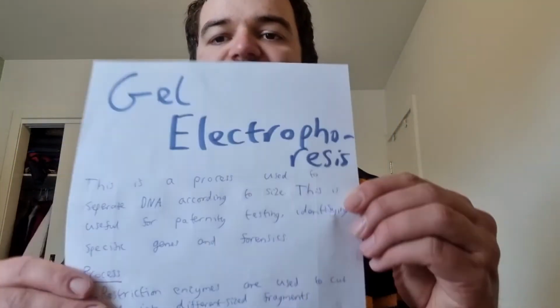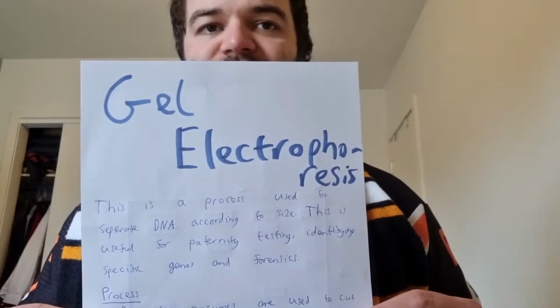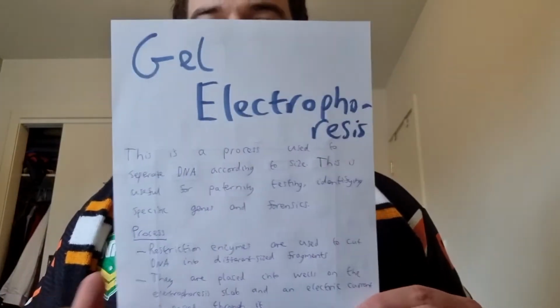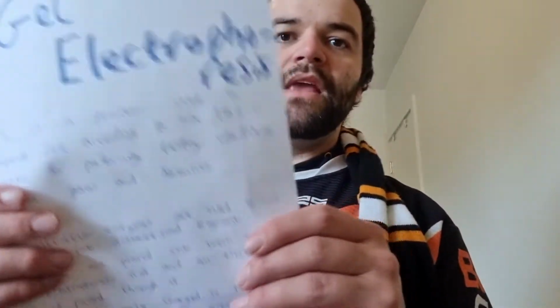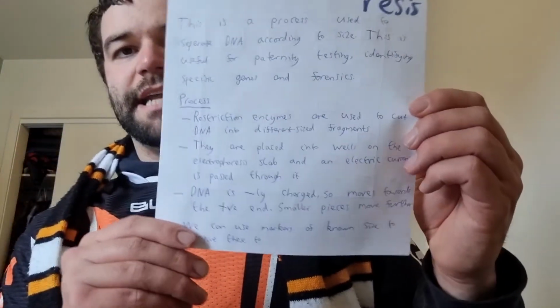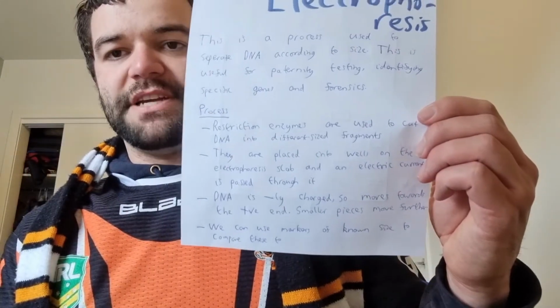So basically, there's your background information. What needs to happen for gel electrophoresis is, first of all, we use restriction enzymes to cut the DNA into different fragments. Hopefully you remember from when we looked at restriction enzymes, they cut DNA at specific sites, and due to genetic diversity, people have different numbers of recognition sites. Therefore, for different people, different numbers of cuts will be made, so the DNA will go into different sizes from that. The DNA fragments are then placed into the well of the electrophoresis slab.